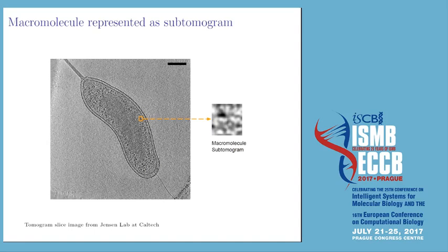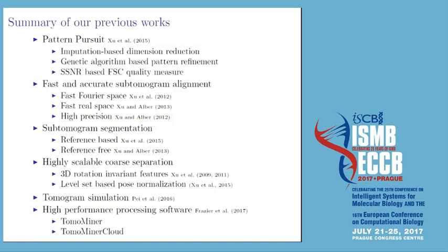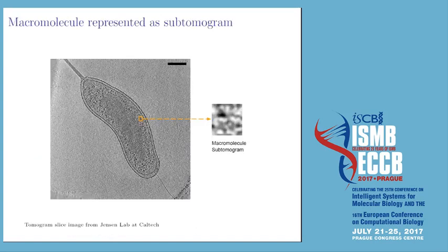In such tomograms, a macromolecule is represented as a subtomogram. A subtomogram is a small cubic region cut out from the large tomogram that is likely to contain a single macromolecule.